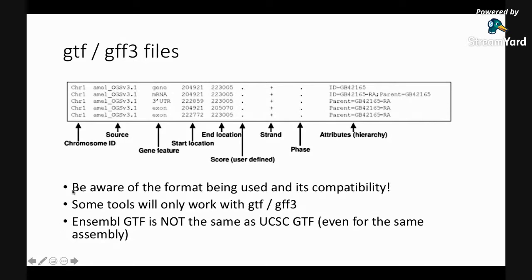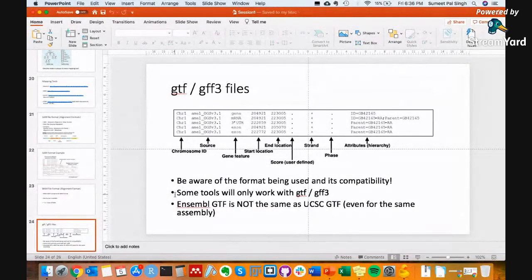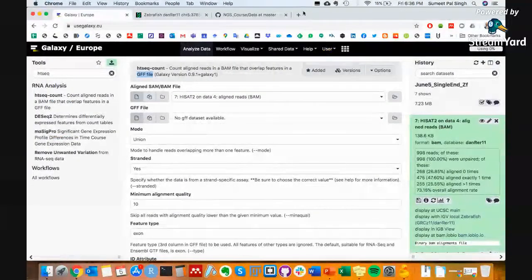But it's very important to note that the format of GTF that you are using is compatible with the genome that you used. Yeah. Because for every genome, you have a specific GTF file, right? So for example, the GTF file from Ensembl will not work with UCSC, yeah, and vice versa, right? So this is something to be careful about, yeah. And I think so we will go and search for the GTF file, yeah.